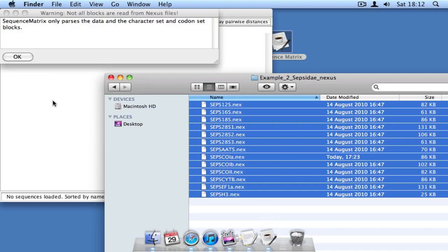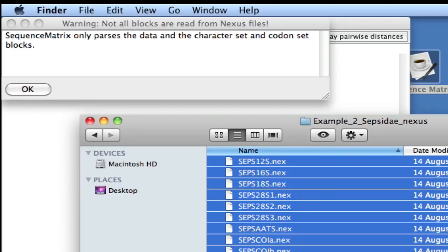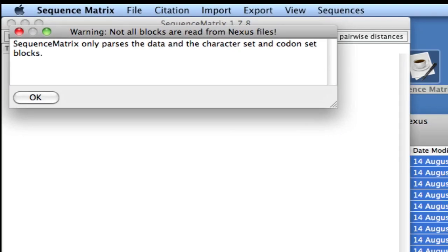Nexus files can contain a lot of information, so Sequence Matrix warns you that it only reads the data, character, and codon blocks. Any other blocks that might be present are simply ignored.